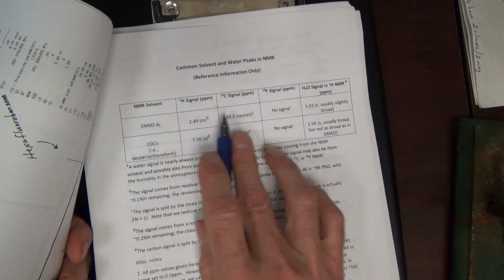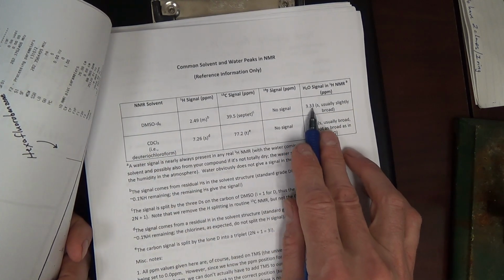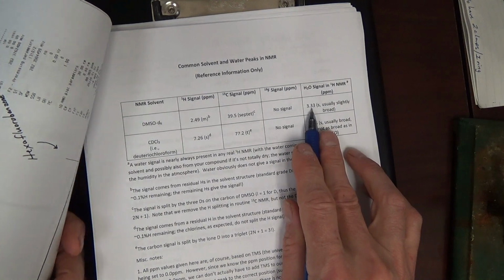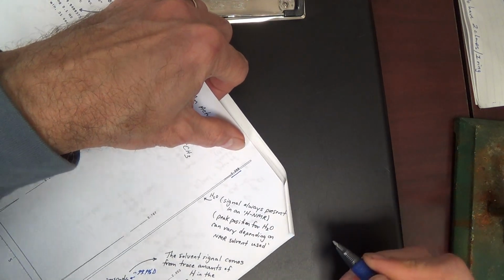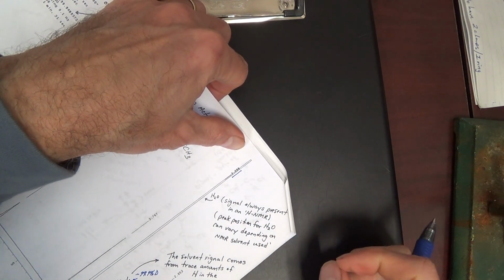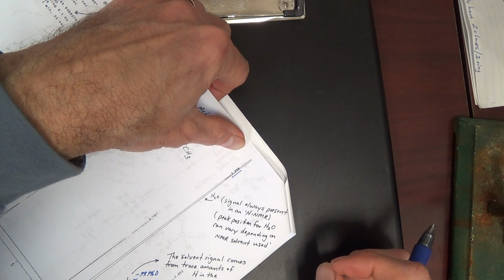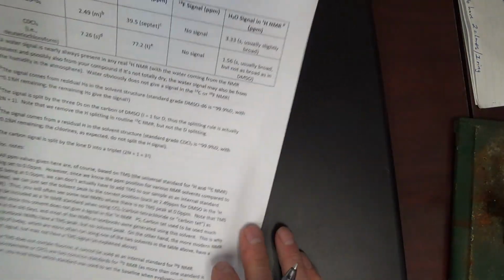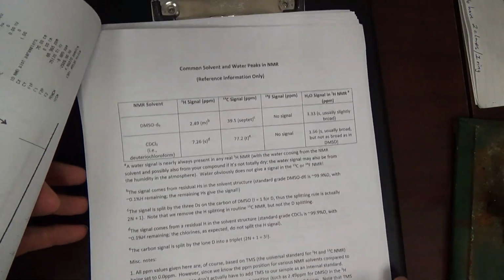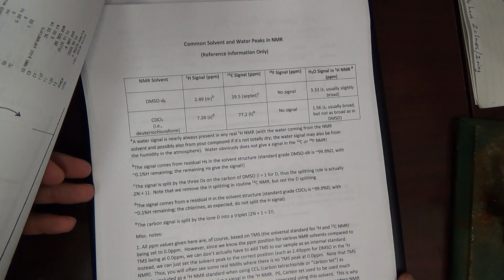In the proton NMR, water in DMSO gives a signal at 3.3 ppm, 3.33. This water signal is about 3.3 or 3.4, and that can vary slightly. So, there's some important information here. It's very practical information.